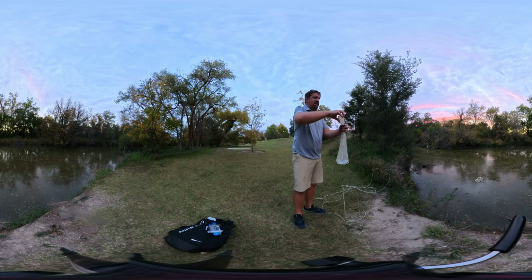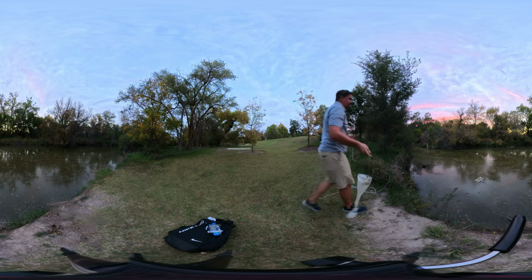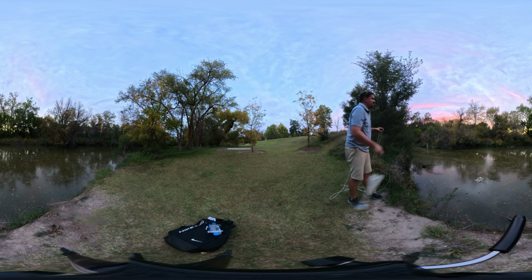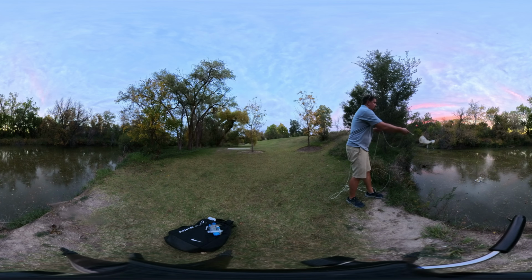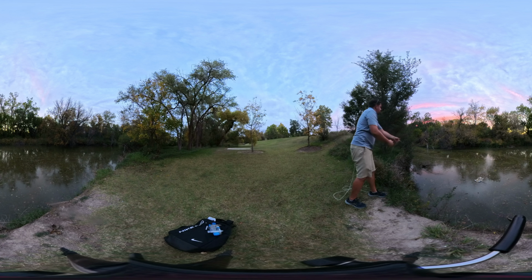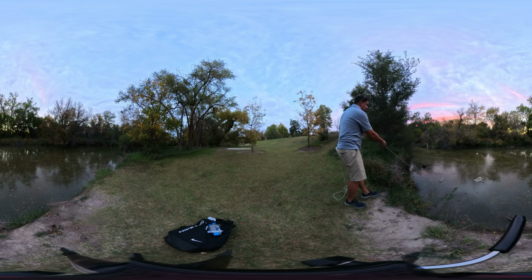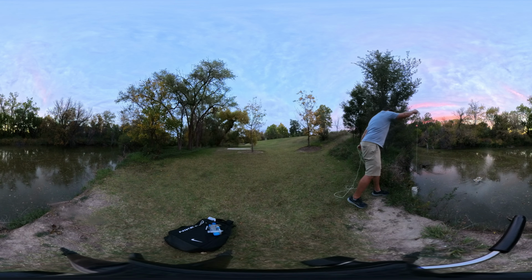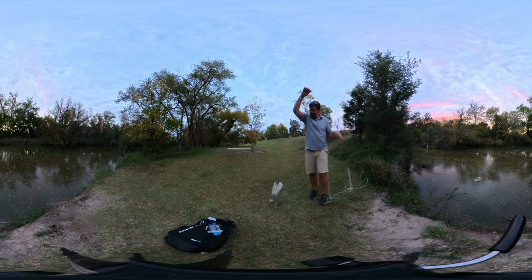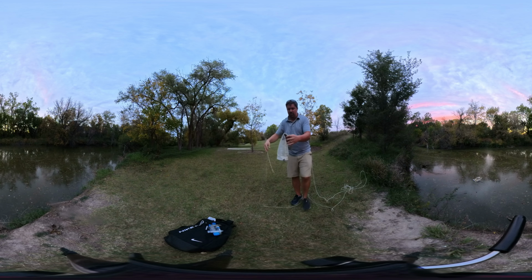Now this area here is not good for swimming anyways, but I do see quite a few people going fishing here, and if this is a cyanobacterial bloom, then you do not want to take some of the fish home and eat them. Not that necessarily that's what the great majority of people do. I think it's more recreational fishing. Okay, let's only get surface now. But you certainly do not want to take fish and consume them when they have been in a cyanobacterial bloom.